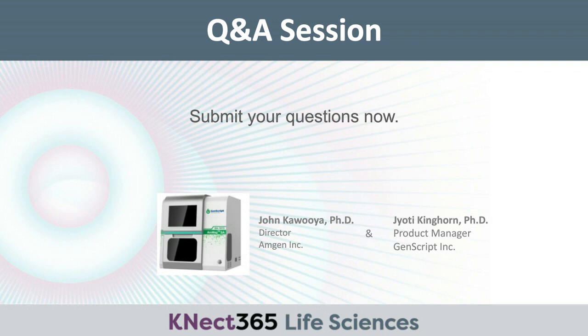So when you go with buffers which tend to be very difficult to elute protein off, you are going to end up with larger volumes because you are constantly going through different cycles of extraction, and you end up with liters of extract. Okay? So the whole story is about the buffers, and that's what I was talking about. Now, in terms of elution volume, of course, we depend again on the buffer composition you're using and the pH. Very low pH, stabilized elutions will give you the best conditions, and we'll be publishing this once the patent is completed.